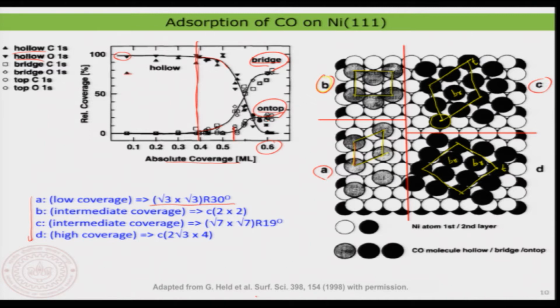And now you can see the density of the structure. Yeah, in the case D, you see the density of the structure. So, this is much more than what you would expect compared to a low packing. So, that means at the lower coverage you have a very loose packed structure, and as the coverage increases you have a very high density structure. So, that is the interesting thing. Now, with this you can make a nice analysis of the interface structure formation of molecular adsorbate on surface.